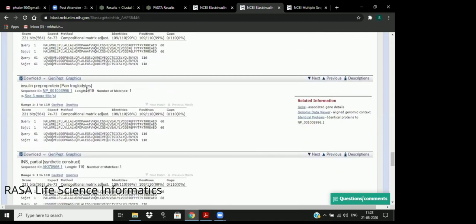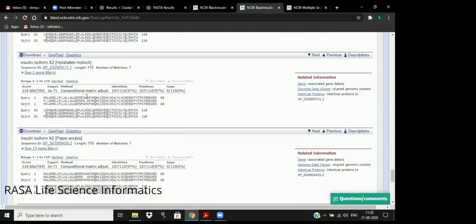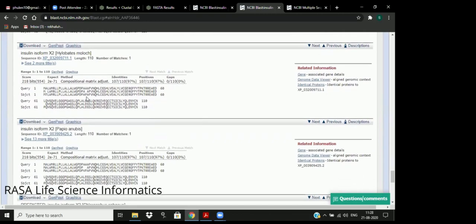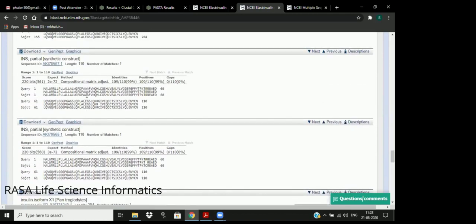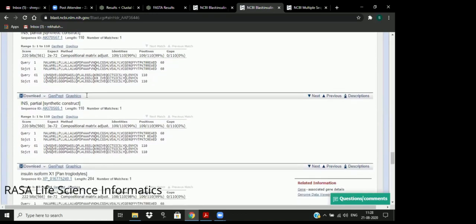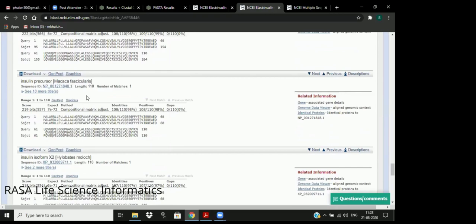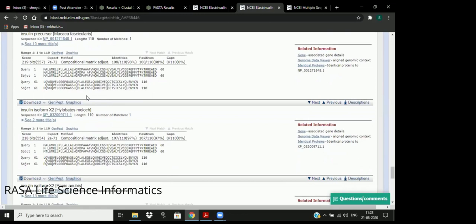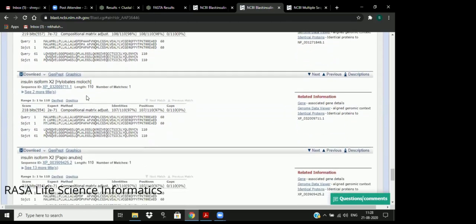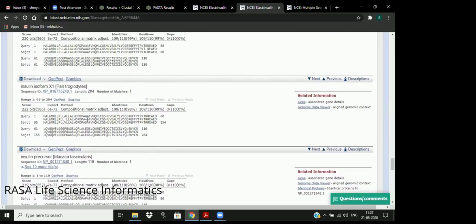Scroll down. Can you stop for a while, please? Scroll up. Stop. You're moving too fast. Scroll down. Stop. A little more down. No. Just see that if you can find a plus sign. Scroll up. There was a plus sign on the top, I think. Yeah, hold. Pan. Yeah. So you see there is a plus sign.